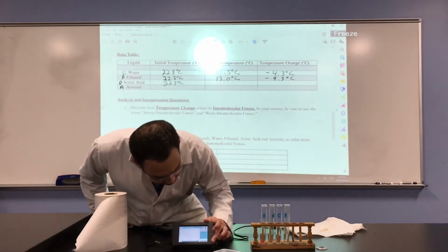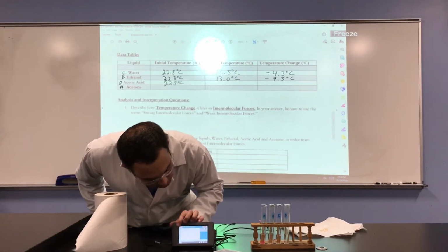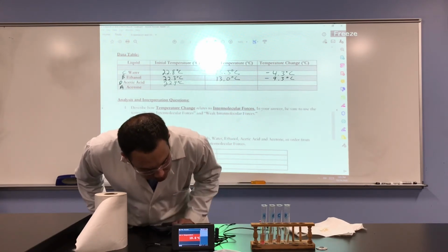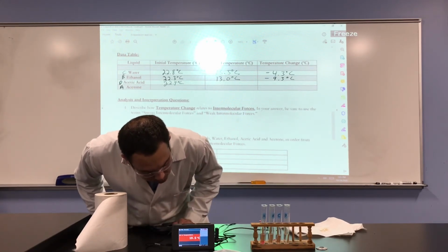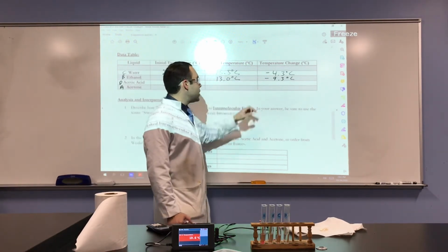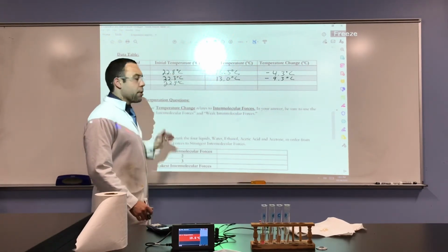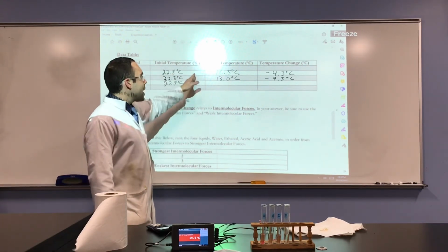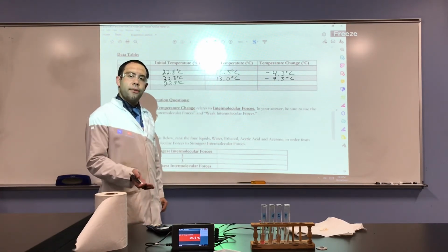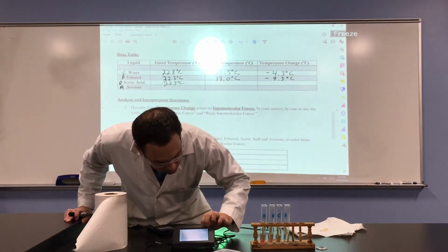We're at 100 seconds, so we have 1 minute and 20 seconds left. 19.6. Remember, we're measuring temperature change to rank these substances on intermolecular forces. The greater the temperature change, the weaker the intermolecular force. And we'll talk about why that is in a little bit.